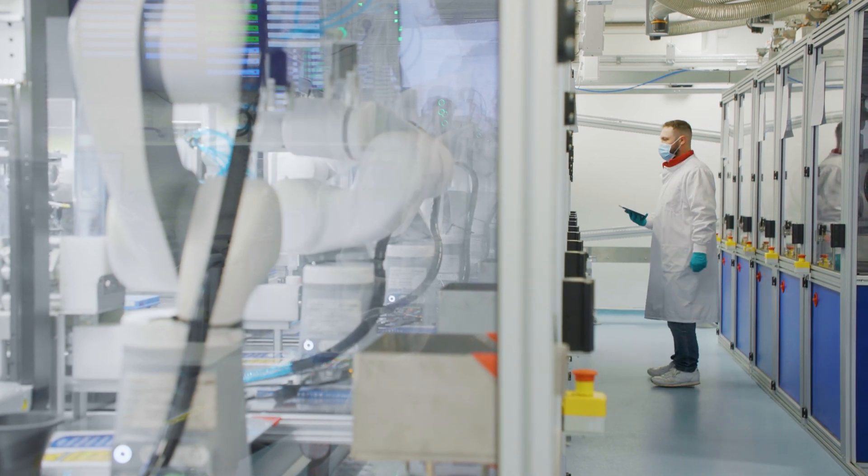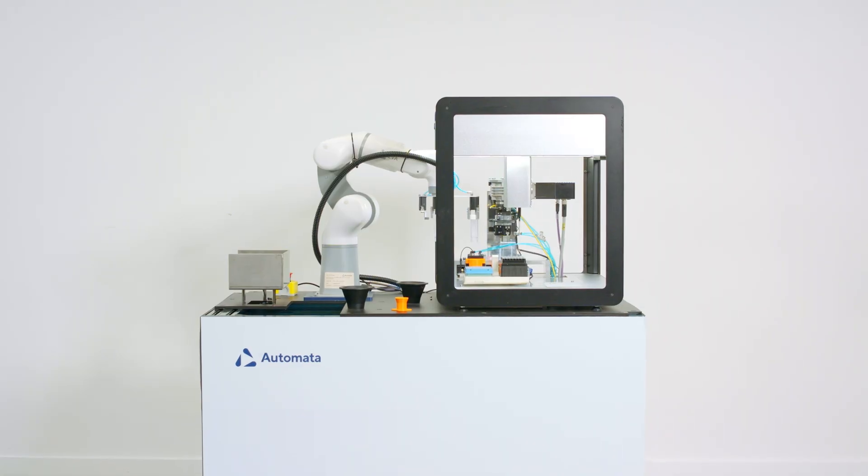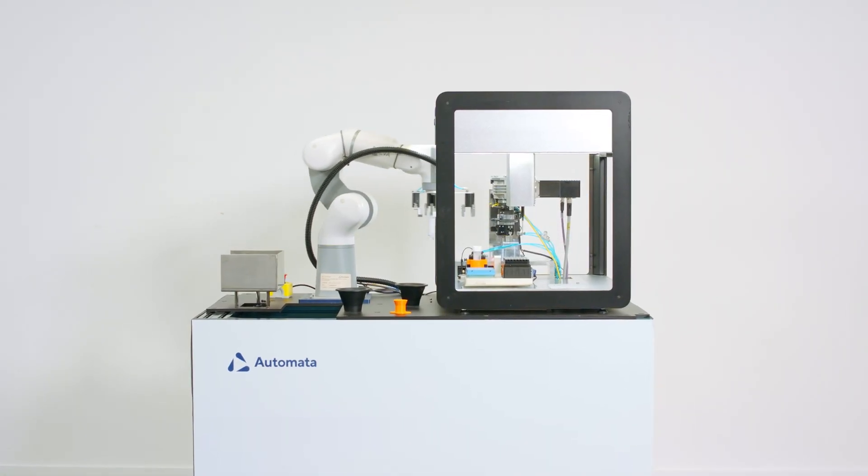Whether you're automating for the first time or increasing the amount of automation in your lab, it can be quite daunting to take an SOP that is designed for humans and turn it into something that works well for robots. Automata has created a simple process we refer to as the automated workflow, where a lab manager works with our engineers to create something that ensures you get all of the consistency and quality of a manual SOP, but with the power and flexibility of an automated system.